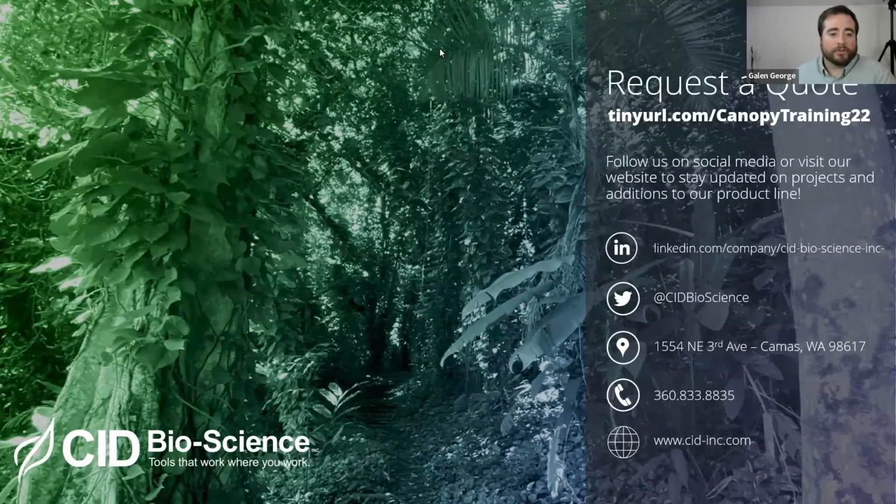The next question is, why is the value so different between the gap fraction and LAI par? A couple of things. One, please don't take any of the measurements that were being taken to heart. We are not in a canopy. We are in an artificially lighted setting in an office. This is not in any way the intended use of this instrument. So those values are not by any means supposed to be accurate or representative of what is actually happening.